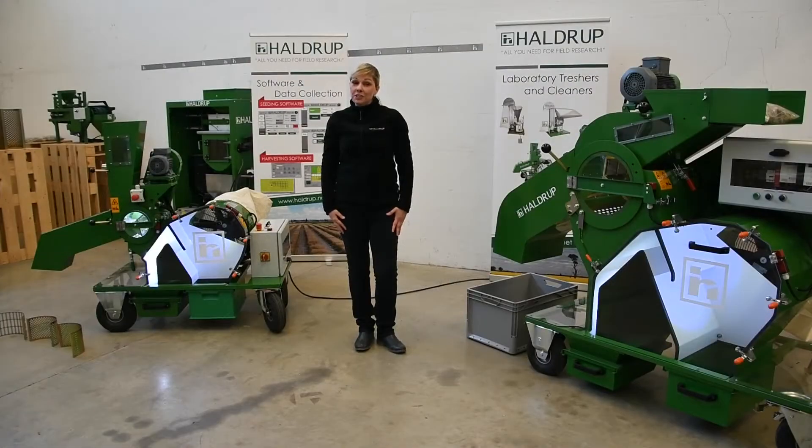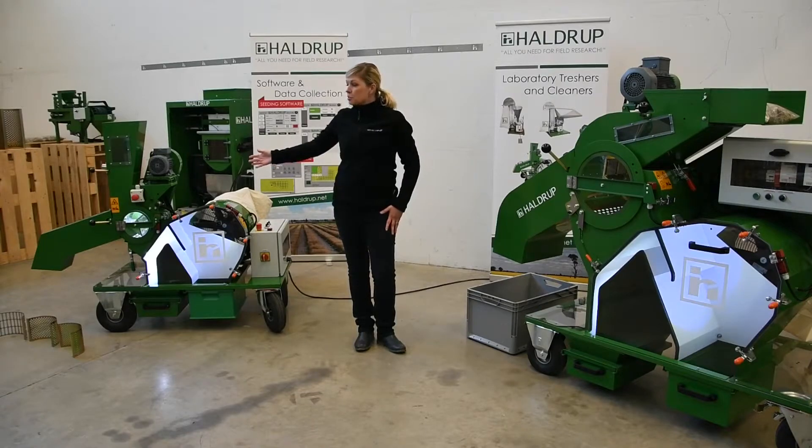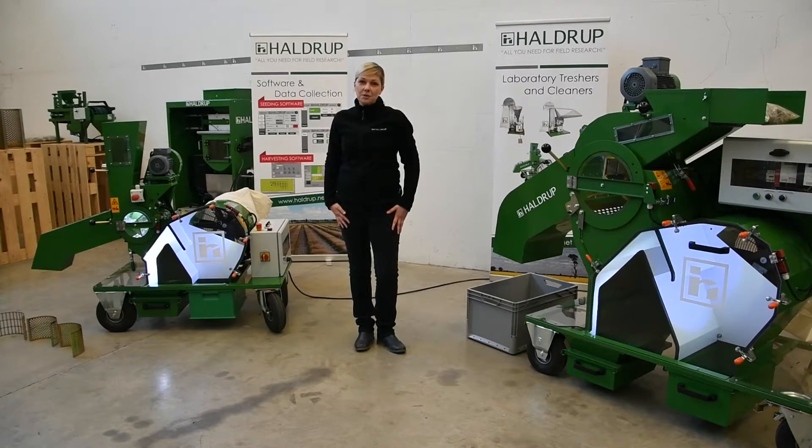We will continue our introduction with the mobile versions of the laboratory threshers. The smallest one in the mobile version is the HALDRUP LT21. This thresher and cleaner has a 21-centimeter diameter threshing unit.